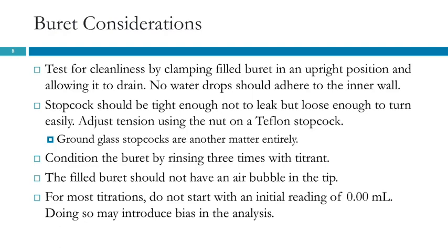So what you want to do is you want to start somewhere below 0, and then you titrate, and you don't pay close attention to where the volume is. You look at the color, and you're going for that first pink color. That's going to give you a more realistic and a more accurate result. Because if your first one was off a little bit, and then you're matching up the rest, then they're all going to be off. Make sense?